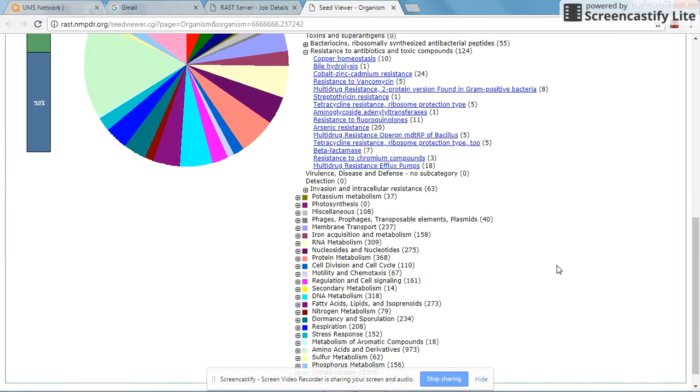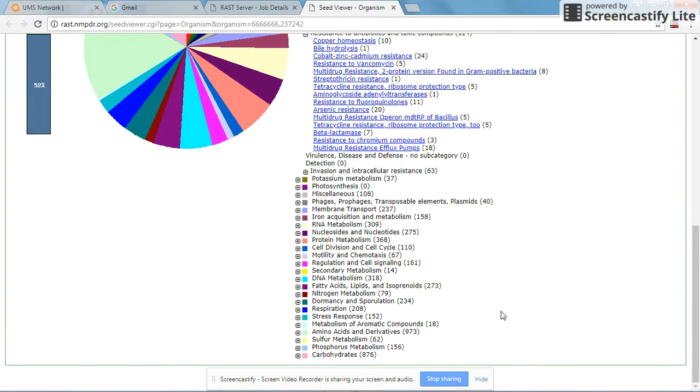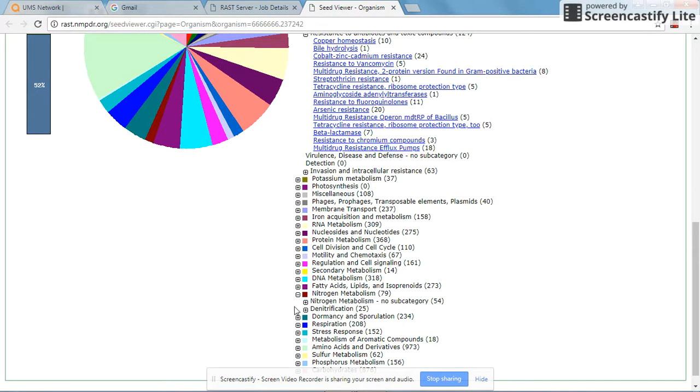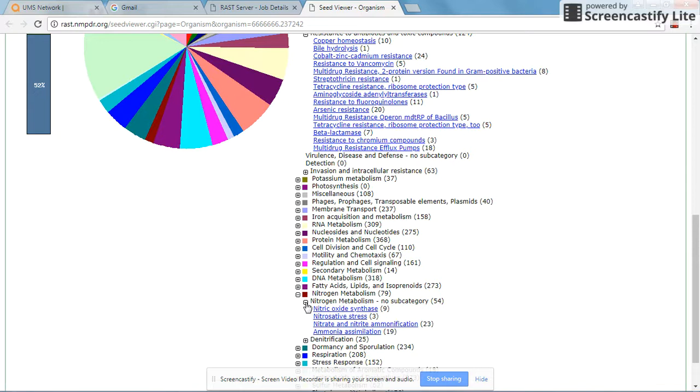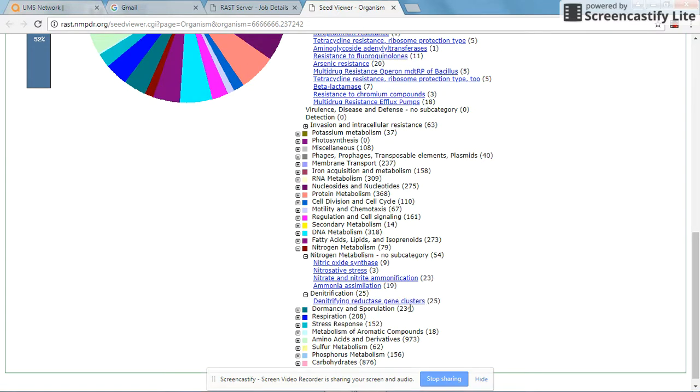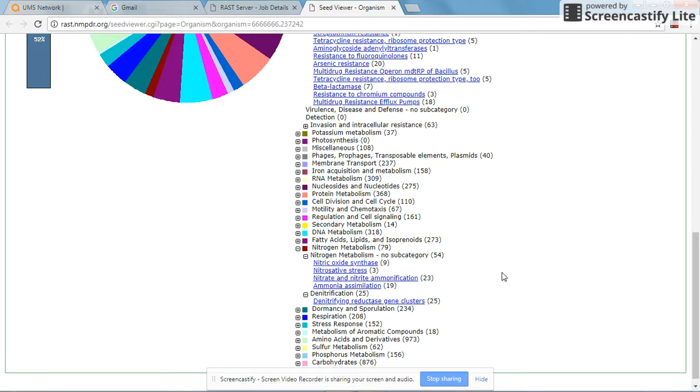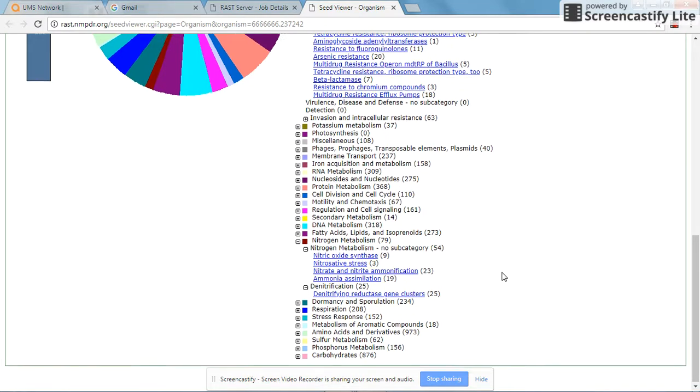We look further at nitrogen metabolism. For instance, you can see that this microbe can assimilate ammonia. In denitrification, it has a denitrifying reductase gene cluster. This gives an overview of the ability of the organism to utilize nitrogen as well as to degrade nitrogen-containing compounds, which is a good indication when you are developing media or doing lab studies.